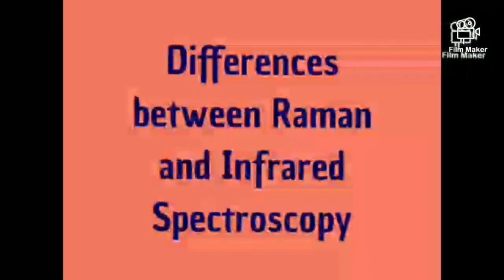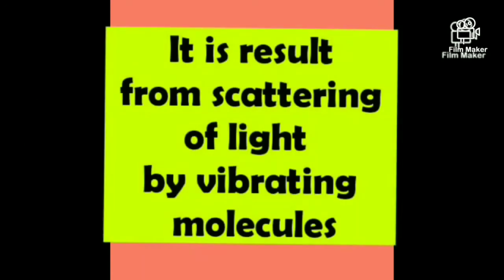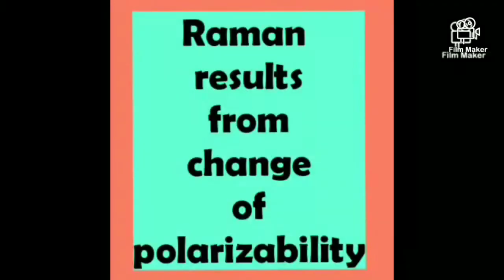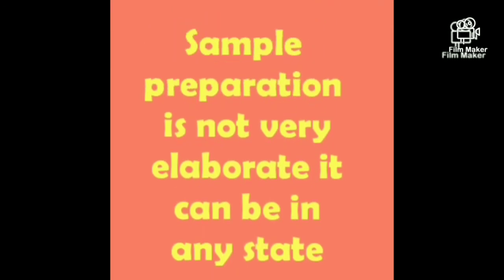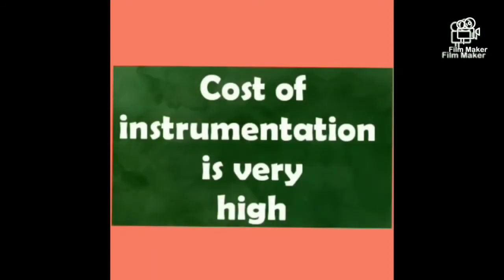Differences between Raman and infrared spectroscopy. Raman spectroscopy results from scattering of light by vibrating molecules. Raman results from change of polarizability. Sample preparation is not very elaborate. It can be in any state. Cost of instrumentation is very high.